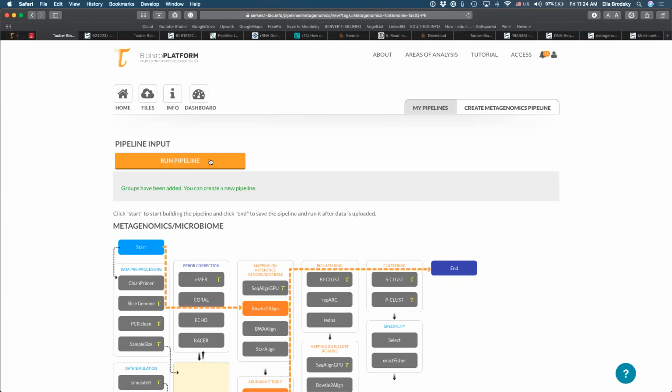No genome, because we're mapping not on a single genome, we're mapping on a database. So we're mapping, remember we have a database called Silva with all the 16S genes, ribosomal RNA genes, and those are helpful because they can help us understand the taxonomy, how they are organized by different levels of taxonomy. These are actually not full genomes, so we don't have a purpose in separating them or mapping them onto a reference genome. Does that make sense, Doctor? Okay, great.